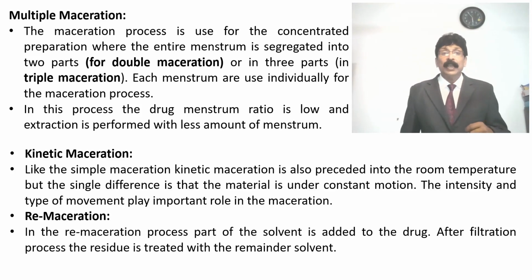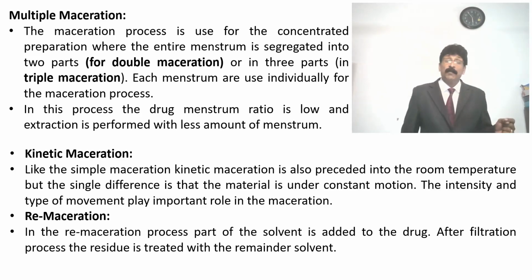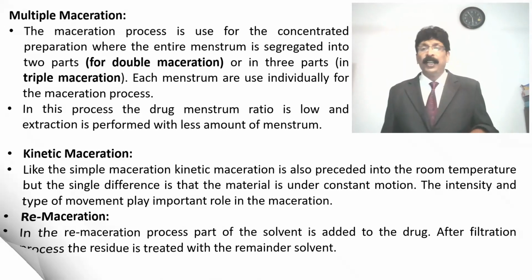Remaceration. In the remaceration process, part of the solvent is added to the drug. After the filtration process, the residue is treated with the remaining solvent.